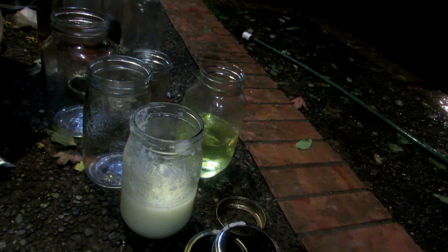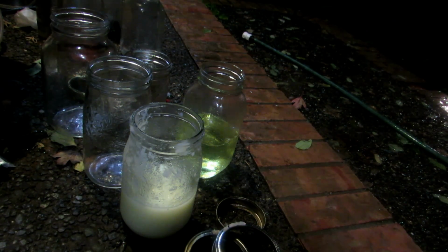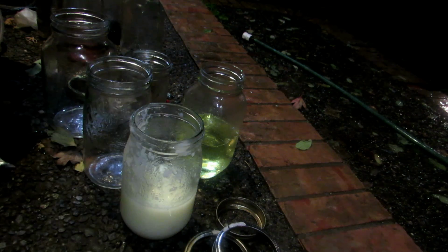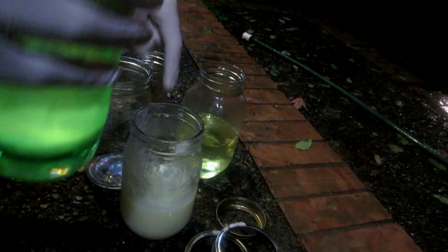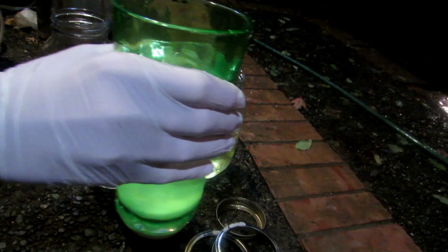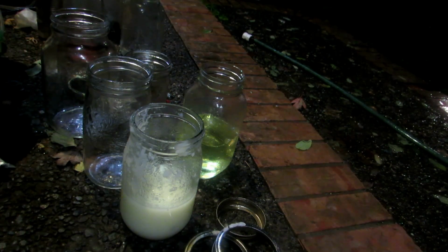Ignore what I said earlier about boiling it down, then decomposing it to sodium silicate, and then silicon dioxide, and then actually removing all the sodium chloride by just dissolving it. That would take way too long. So I came up with an idea with our silicic acid here. It's not soluble in water, it appears. So upon adding a bunch of water such as this, we could dilute it.